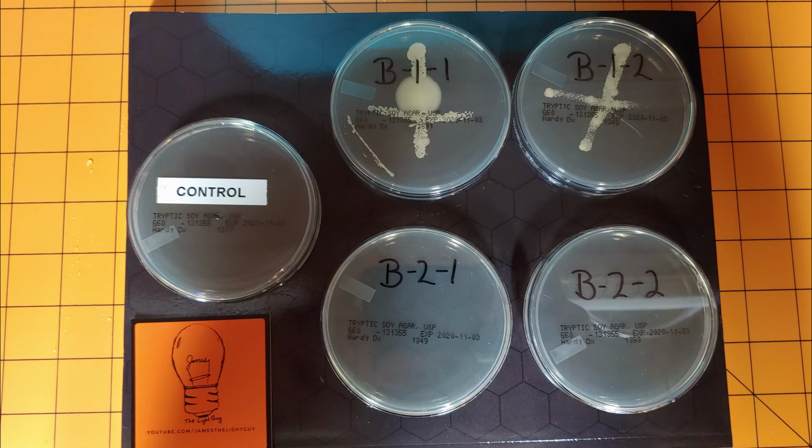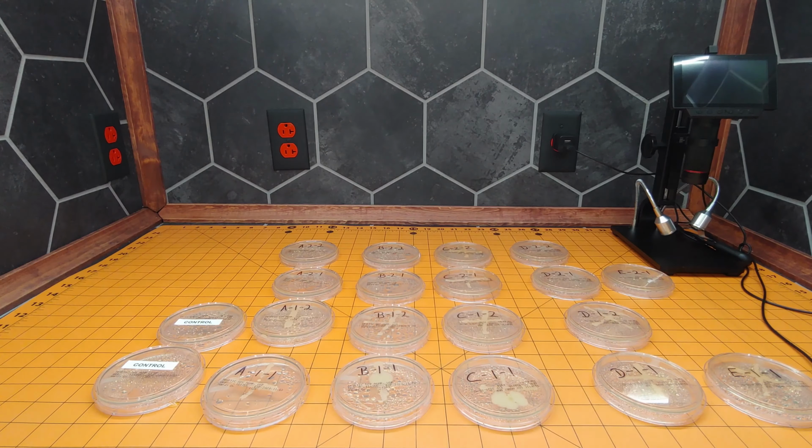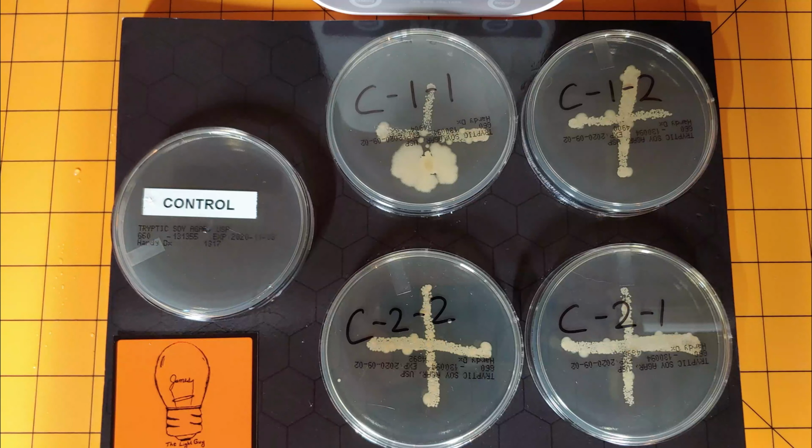Moving on to box C. Was our UV sterilizing disinfecting coating machine. As I had previously said, this box is fake. It uses just plastic tubes and cheap blue LEDs, and as a result, well, you can see our pre-sterilization and post-sterilization are no different. Our contamination remained the same on both samples. So once again, this particular device is 100% proven fake. 0 score given on the sterilization.